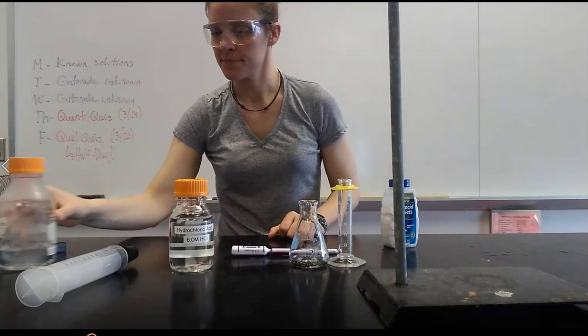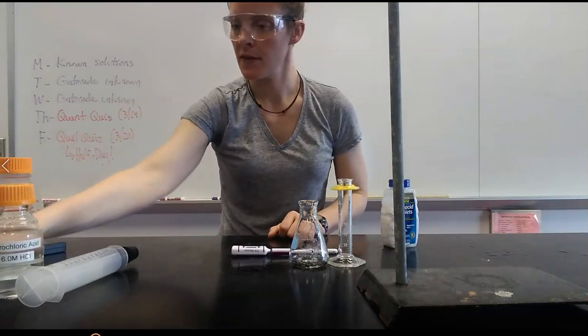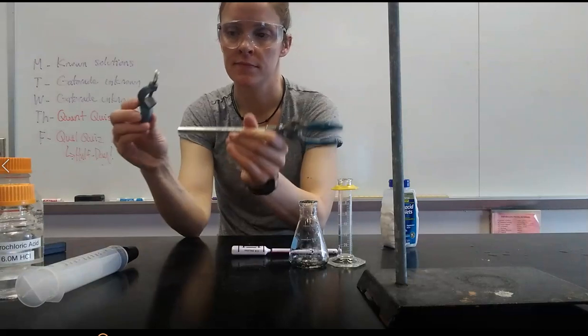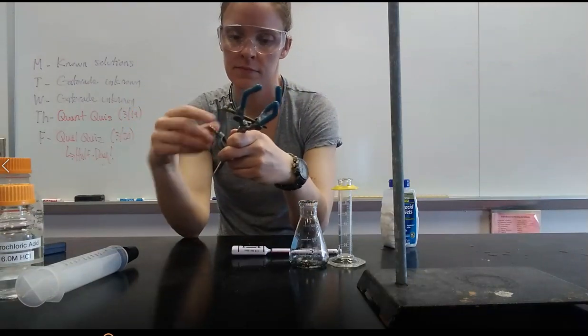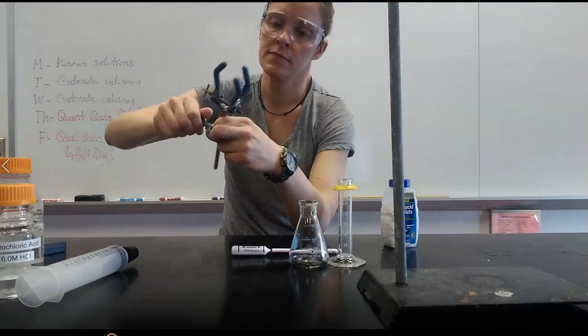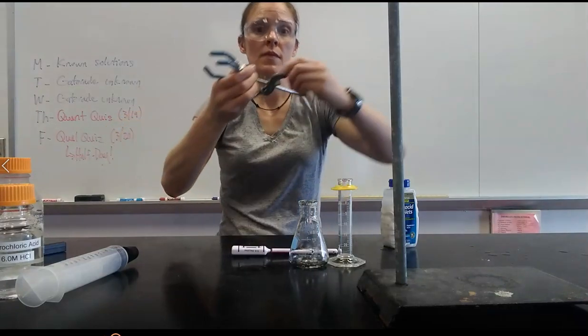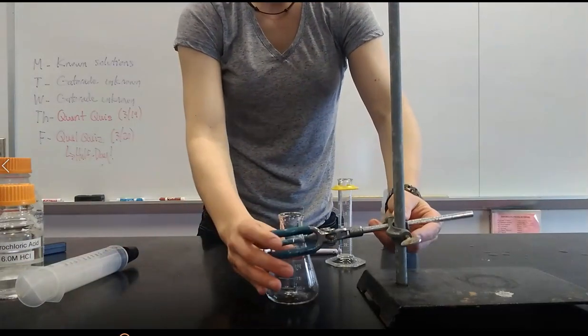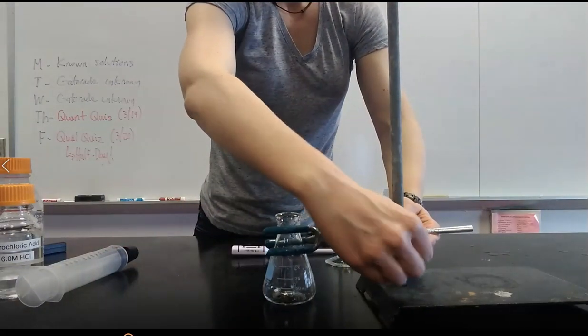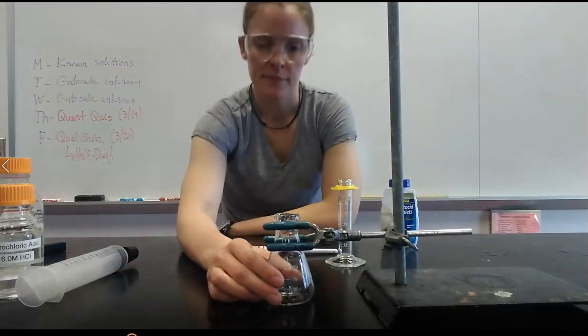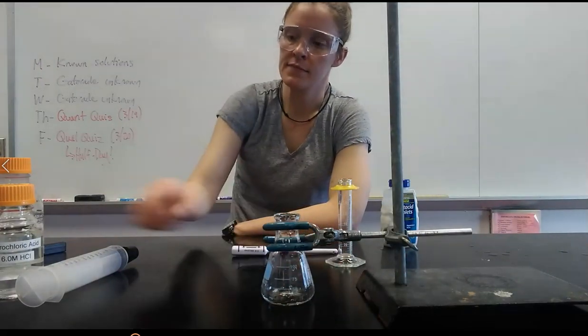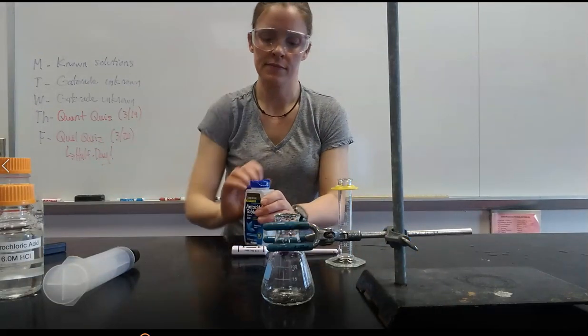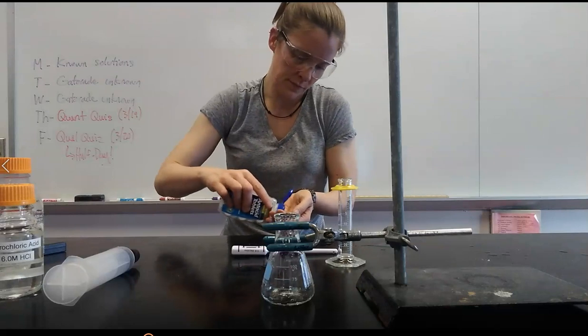The setup for the lab is really simple. You are going to use your three-pronged clamp and your utility clamp, get those clamps together and attach that to a ringstand. We want to use the ringstand to help support our Erlenmeyer flask. It is really easy for this thing to fall over when the setup is finished and you don't want the acid spilling all over the place.